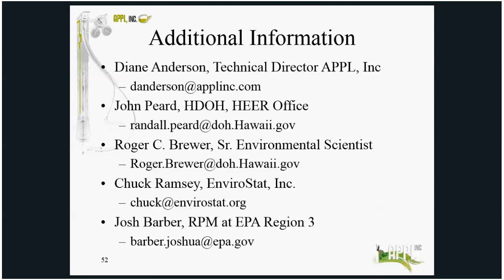As it says in the method, that's what you're going to do, so we do. We don't always supply it in the final report because our customers don't always want it, but it's there. And we always put the raw data in there so that if they wanted to look, they could find it.